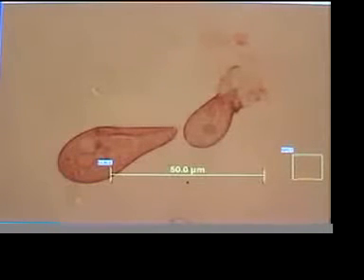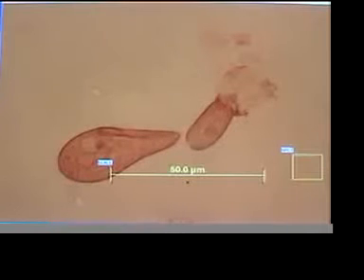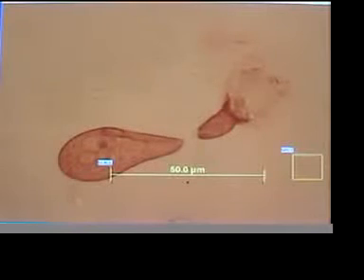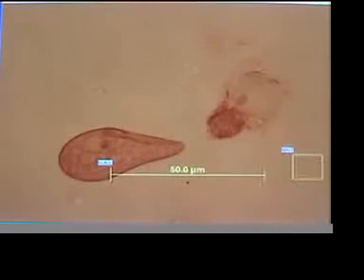100 watts, SWR 1.2, 927 Hertz, ran for 562 seconds to start that. Plus, it's 927 Hertz plus 10,164 Hertz. Notice that the organism next to him is not doing this. This is kind of the mystery of this whole process. Not all organisms are affected. Look at the edges here. They start to take on a granulated shape and then they explode into a series of sphericals like that.